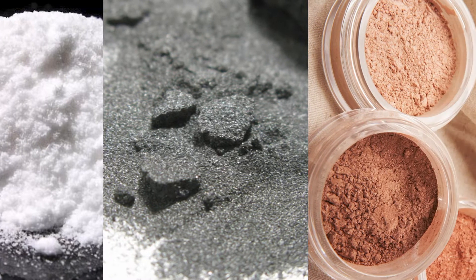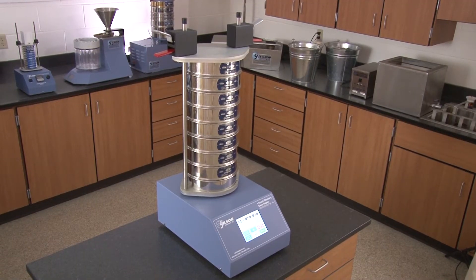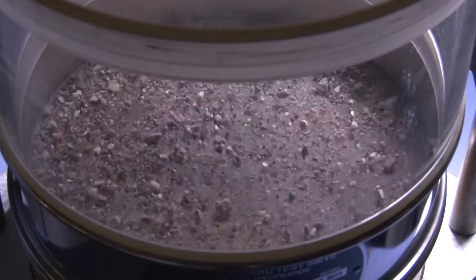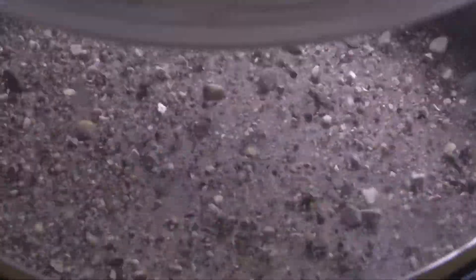Including minerals, pharmaceuticals, metals, and cosmetics. This quiet unit combines the latest in electronic control with proven separation technology for fast, accurate separation of samples without the loud noise levels of mechanically operated shakers.